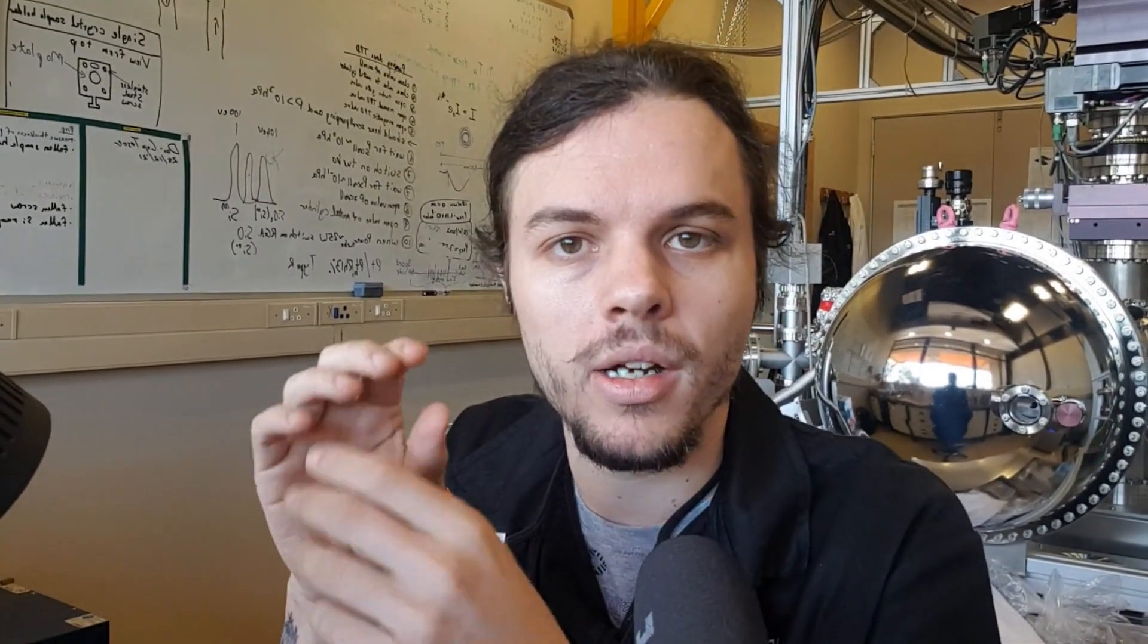Hello there skeptic squids and welcome to the lab workbench. Today I'm going to give you a quick little tour of how to prepare XPS, or X-ray photoelectron spectroscopy, sample holders for this amazing little machine behind me.